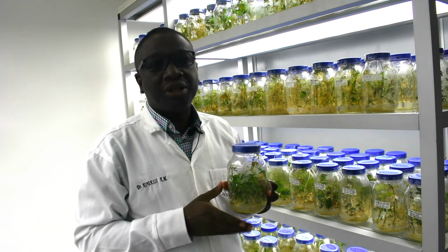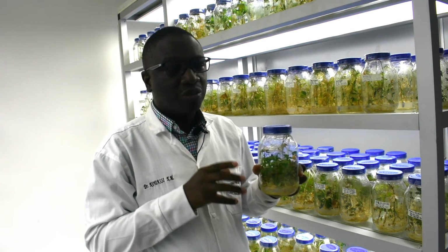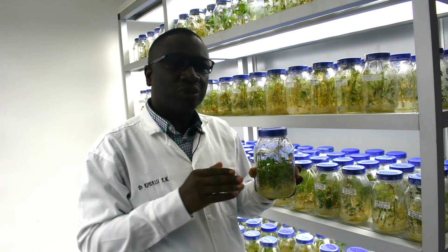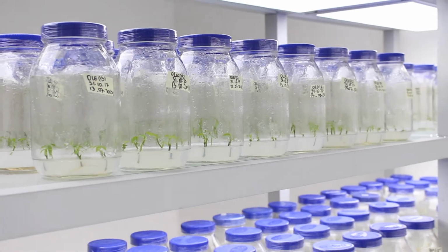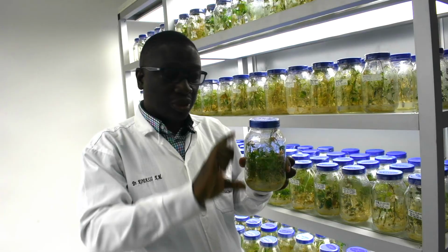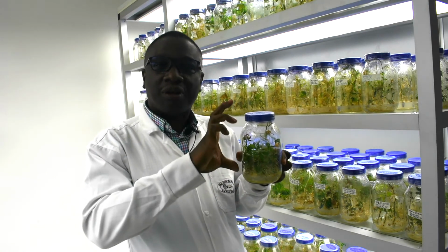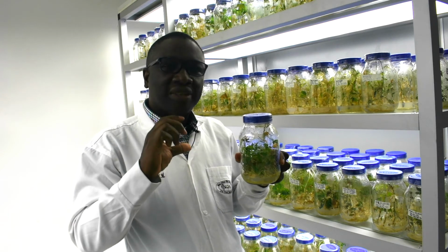In this container we can put from 7 to 10 plantlets, explants that will develop into plantlets. We have this possibility to reduce the height of the container but to keep the number of plants.